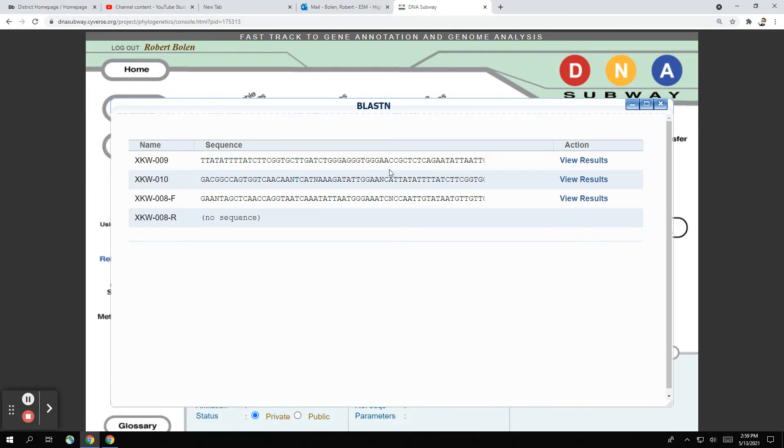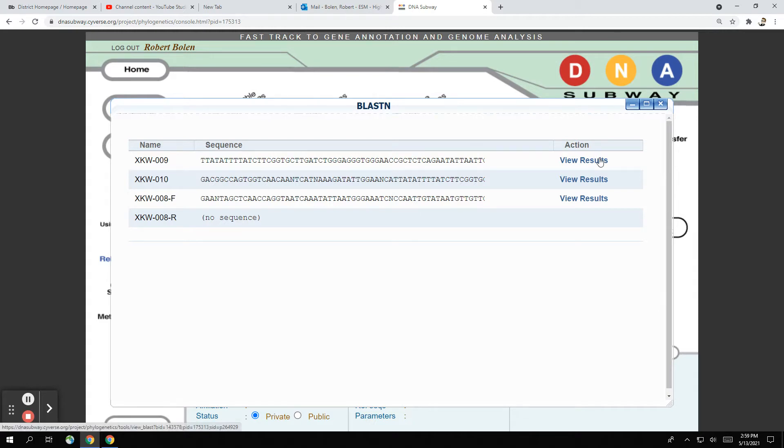So I have a sample here of different sequences and these sequences have been trimmed already and we ran them through BLAST. We hit the button to run BLAST and everything ran. It does take a little bit of time so you have to be patient and now we can view results.